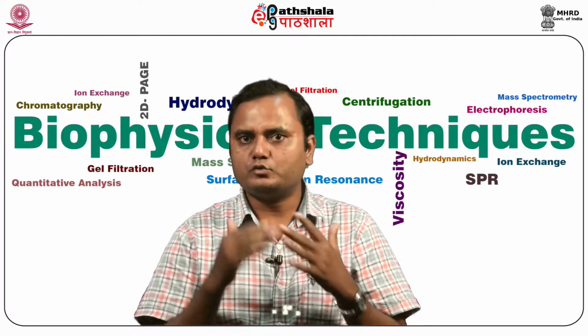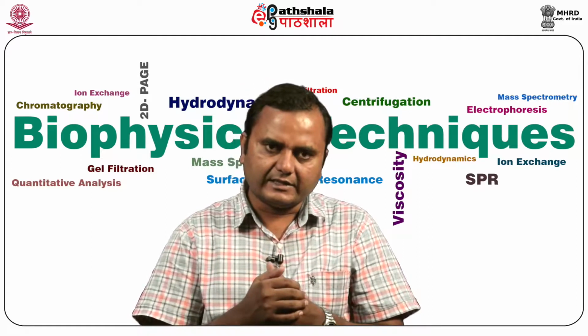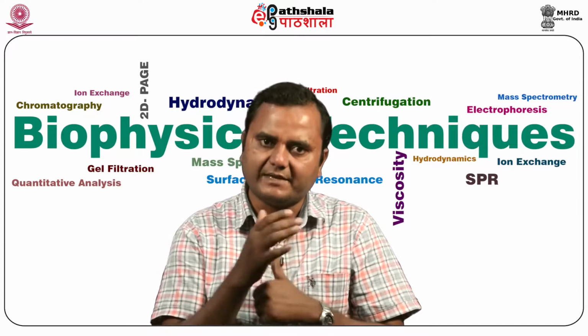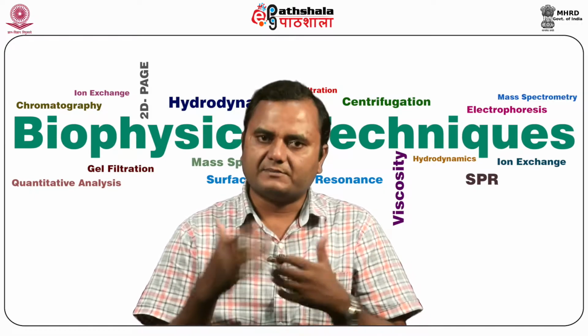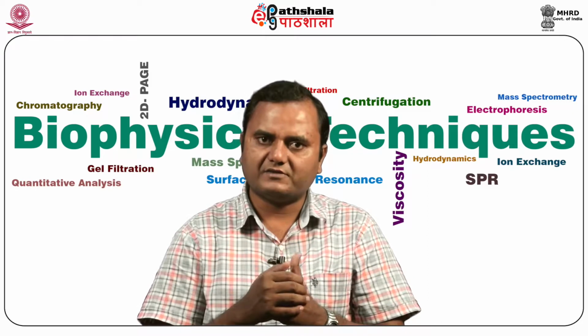So these are the two optical systems associated with analytical ultracentrifugation for the measurement of the dynamic picture, for the measurement of molecular mass and other biological features of a particular molecule during the ultracentrifugation process.